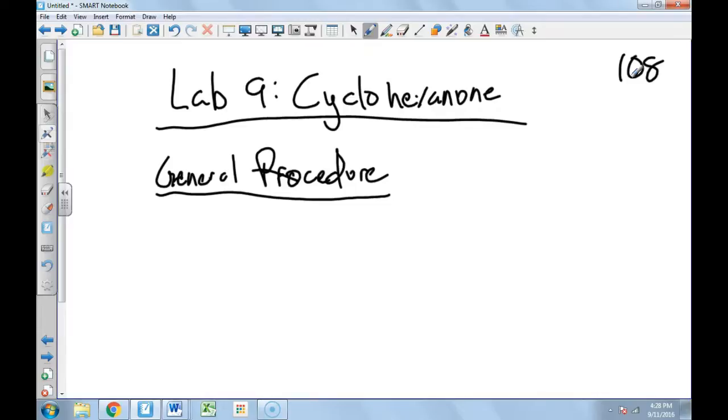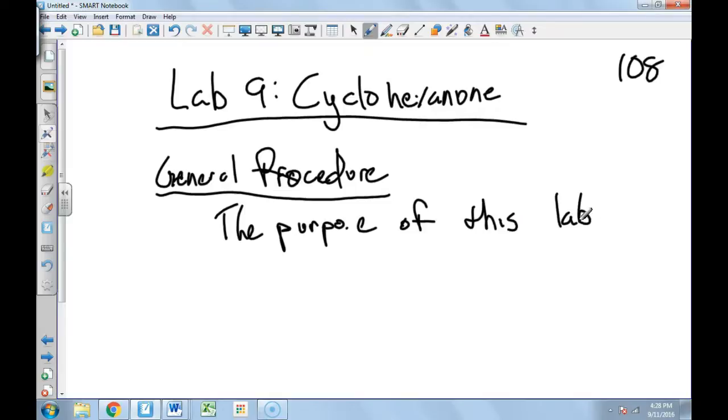Sorry. But every general procedure is going to start off with a purpose. So you're going to write a one-sentence purpose, and for lab 9 specifically, the purpose of this lab is to blah, blah, blah.